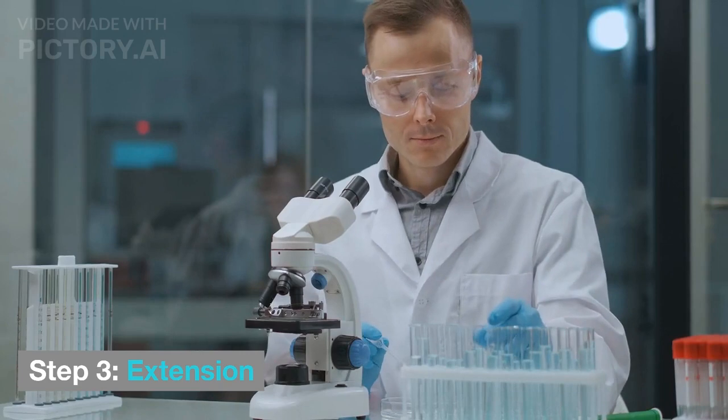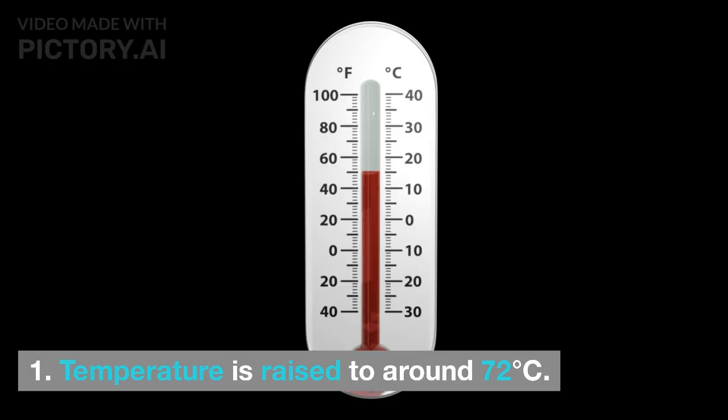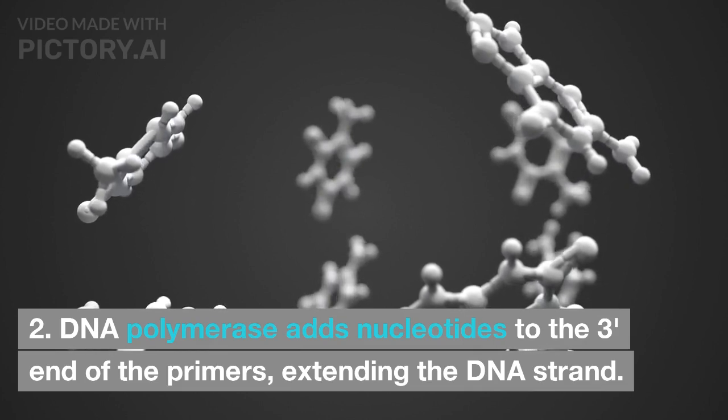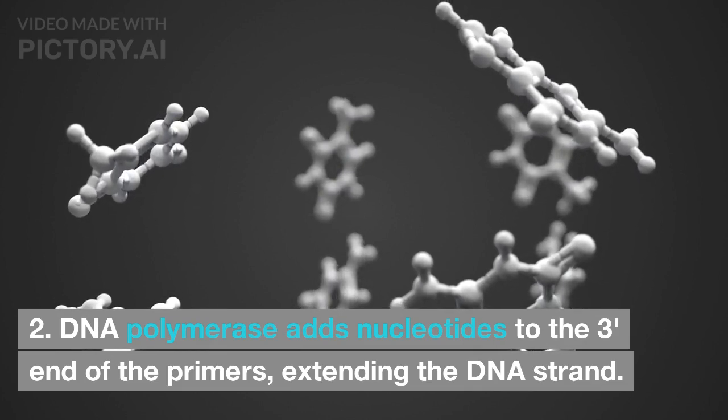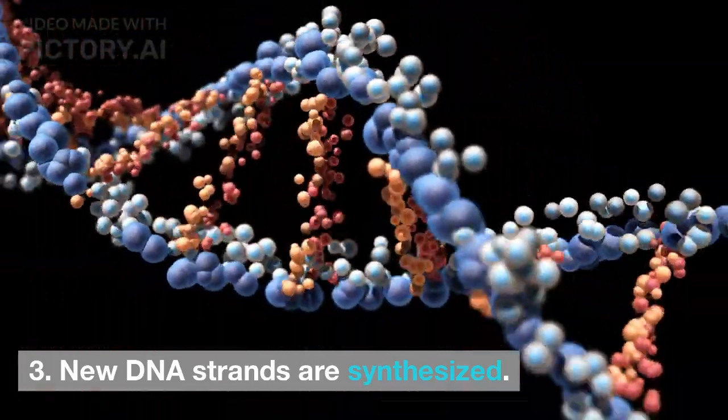Step 3. Extension. Temperature is raised to around 72 degrees Celsius. DNA polymerase adds nucleotides to the 3' end of the primers, extending the DNA strand. New DNA strands are synthesized.